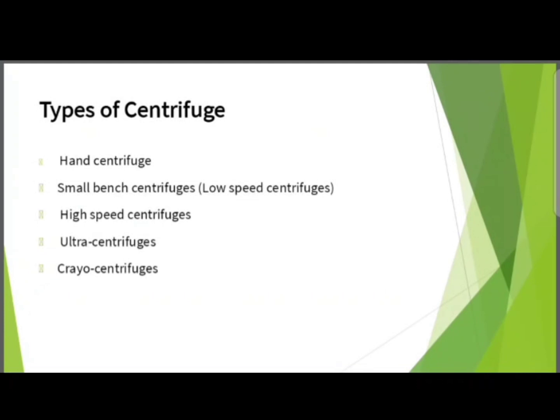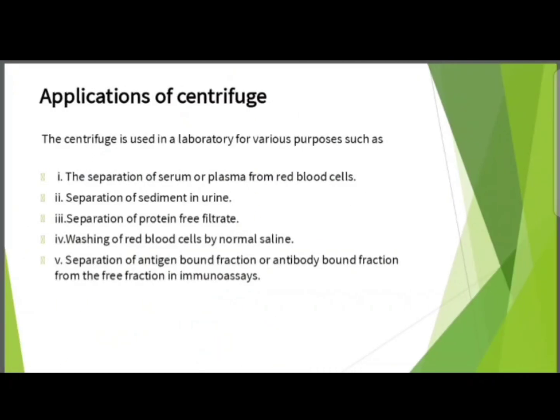What are the types of centrifuge? There are basically five types of centrifuge: hand centrifuge, small bench centrifuge, high speed centrifuge, and so on.